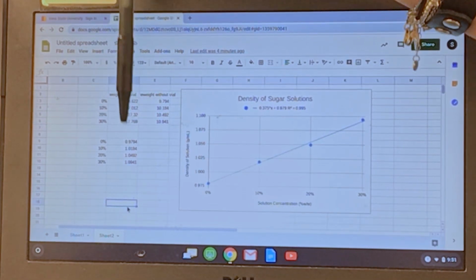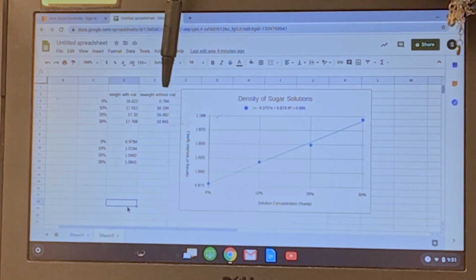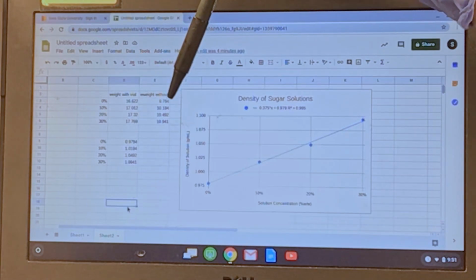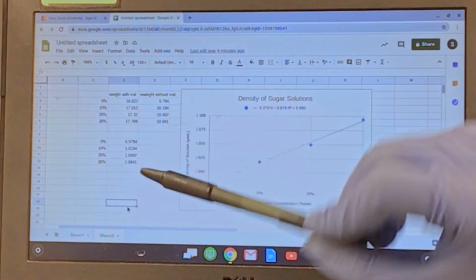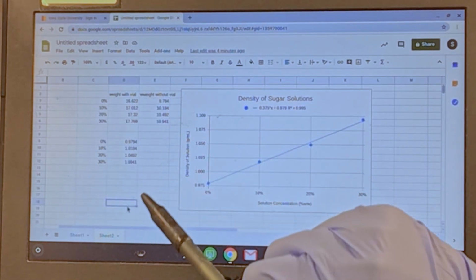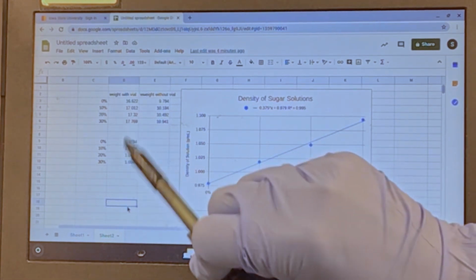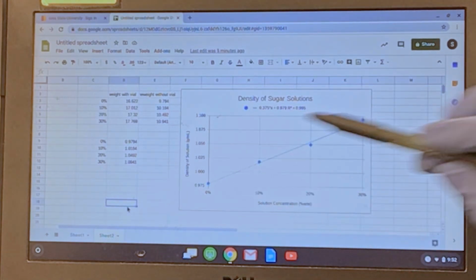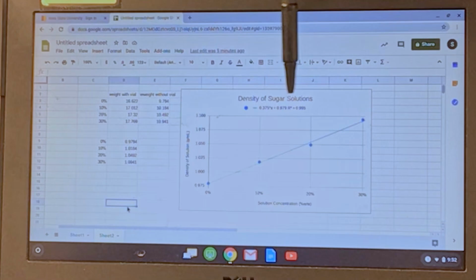and 30% sugar with the vial and without the vial. Now, the lab manual wants you to calculate the density of these solutions, okay? Just taking the weight divided by the volume, so these divided by 10 and so on. So you will have on your x-axis the concentration of your solution, and on the y-axis the density of the solution. Then you make a plot, and you need to make sure that you add a title that is meaningful, so that who doesn't know what you did immediately understands what the graph is representing. So in this case, density of sugar solutions.